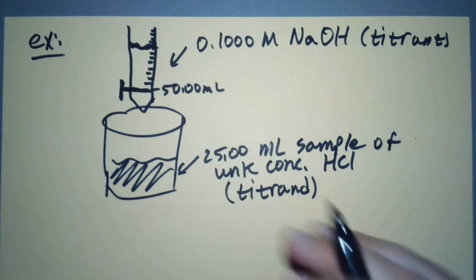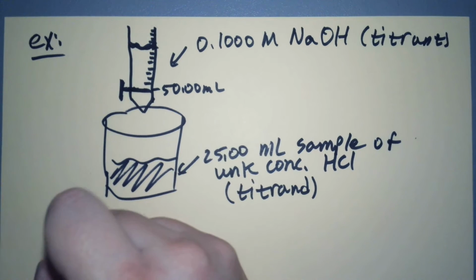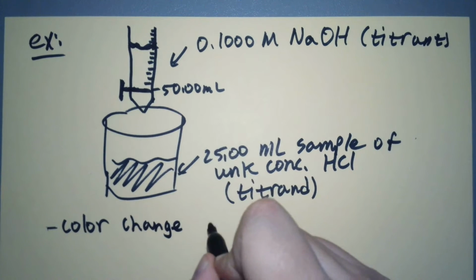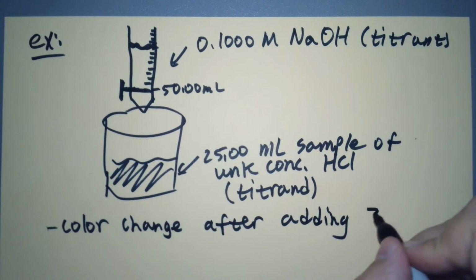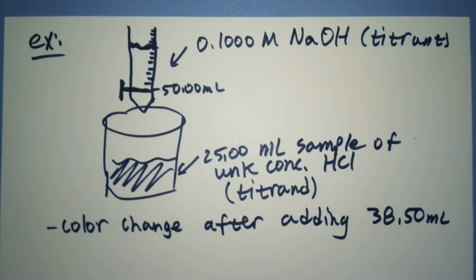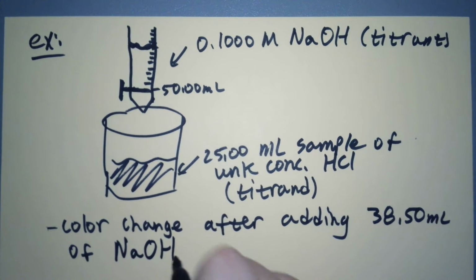And so we get a color change after adding 38.50 milliliters of the sodium hydroxide.